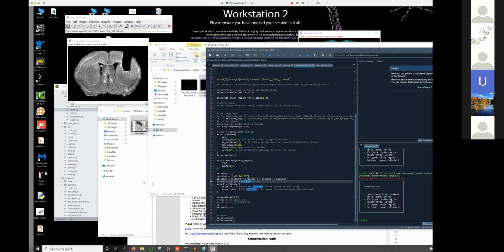One final thing that we could do is also measure that distance from the brain surface. So to do that, instead of adding in a cylinder, we can add in a ruler. And this is just 2 lines of code. We're saying create a ruler, and there's a tool called ruler from surface, from the position to the surface of the brain. The root is just the whole brain, and give a scaling in millimeters, and then add that ruler to the image.